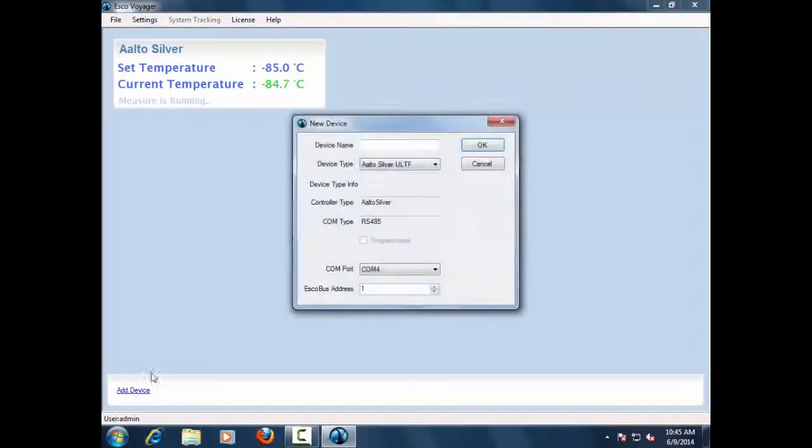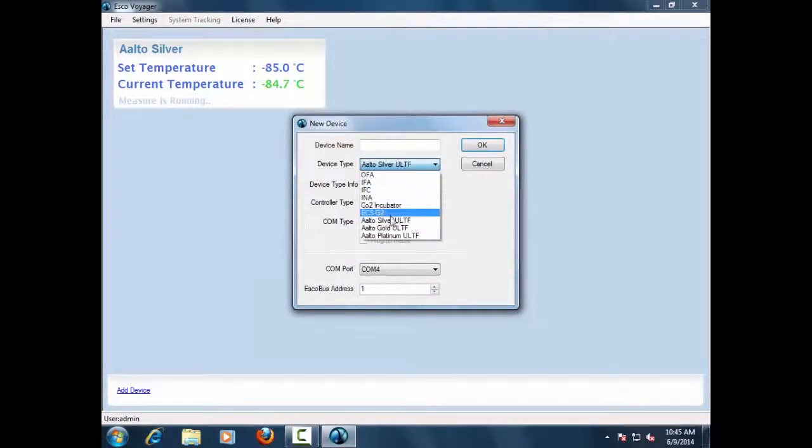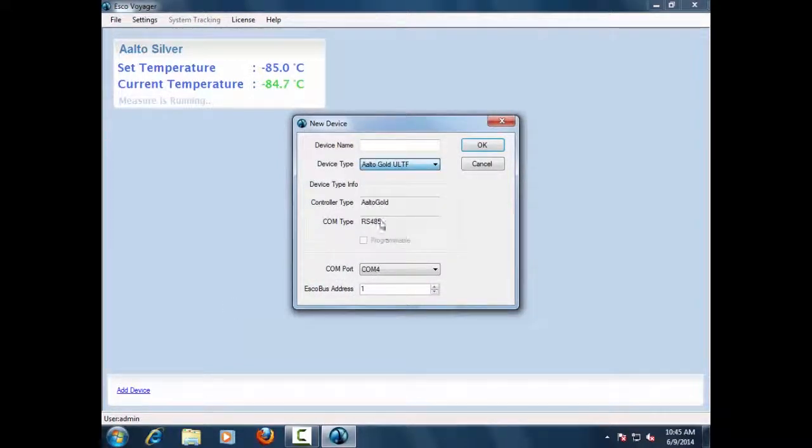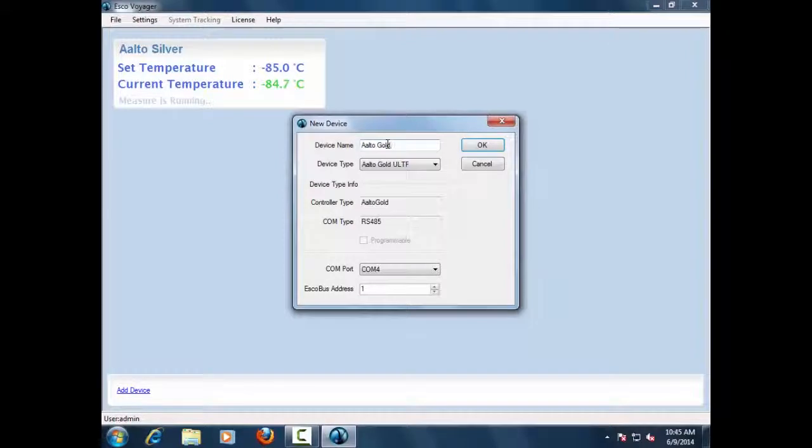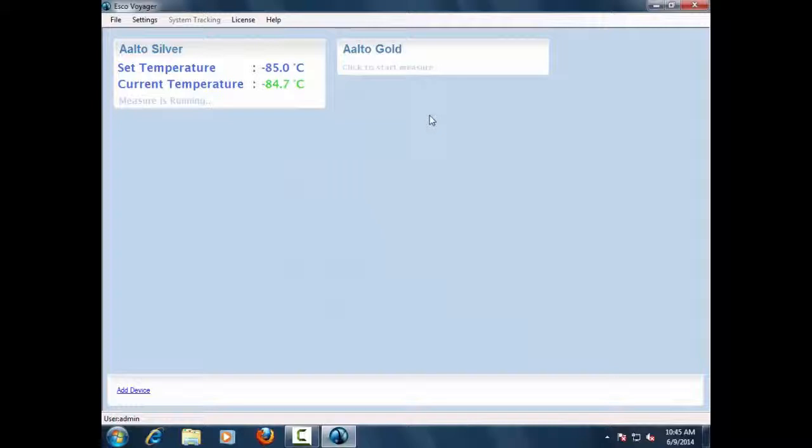Using the RS-485 interface, the Voyager software can be connected to up to 32 different temperature control devices, such as Lexicon 2 ULT Freezer with silver and gold controllers, CO2 incubator, lab incubator, lab oven, and refrigerated incubator.